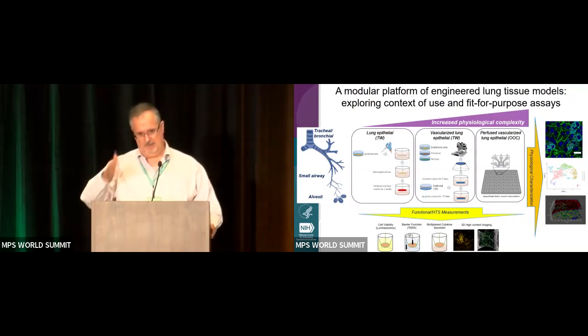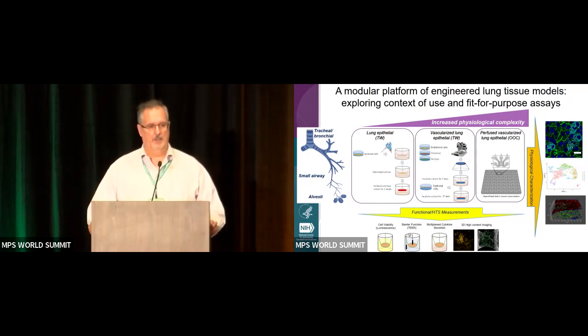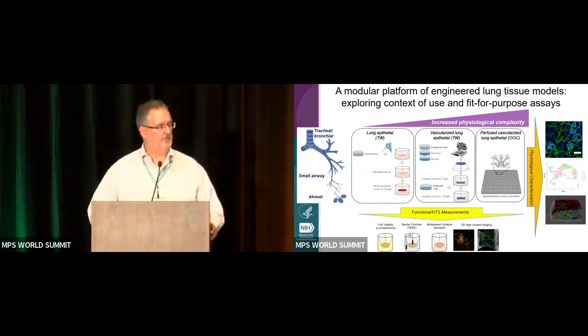I'm not going to go through some of the basics of the lung, but for the lung, we've been leveraging existing commercially available tissue models of the different areas of the lung, whether it's the tracheobronchial, small airway, or alveolar. And we are also developing our own platform. We have used microfluidic platforms that are available, and our choices were based a lot on throughput.